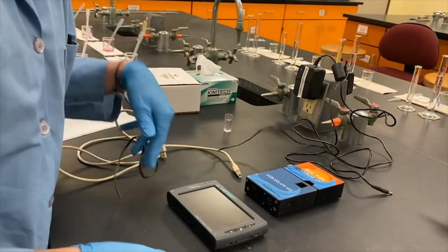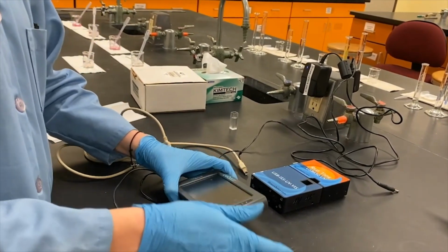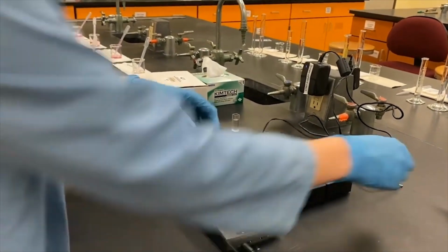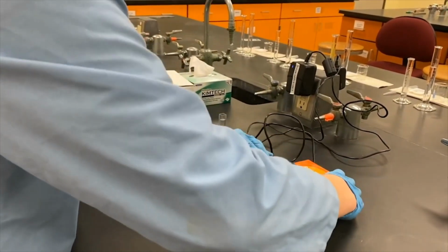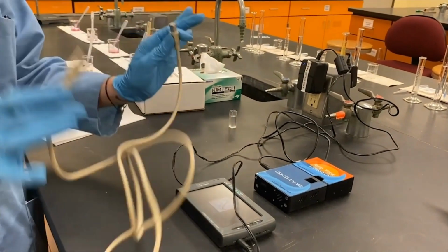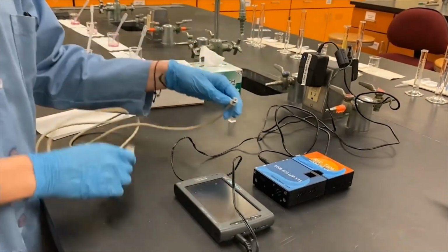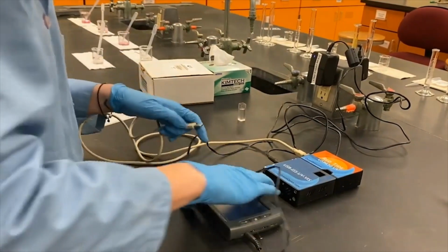So the first thing we have to do is plug everything in. There are two adapters here, so you just want to make sure you have the correct adapter with the correct equipment. Otherwise, you can risk frying the machines, and that's no fun and a kind of expensive mistake. And then the last thing you need is this tan cord here. That's going to help the two pieces of equipment talk to each other.